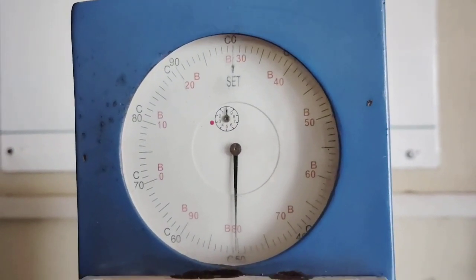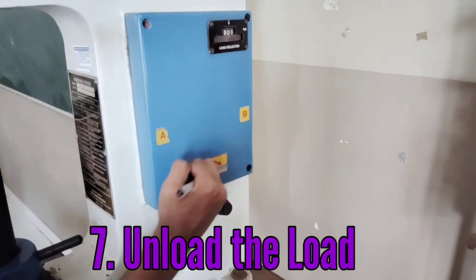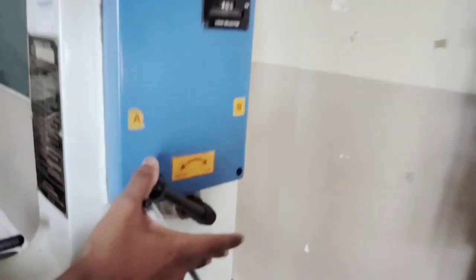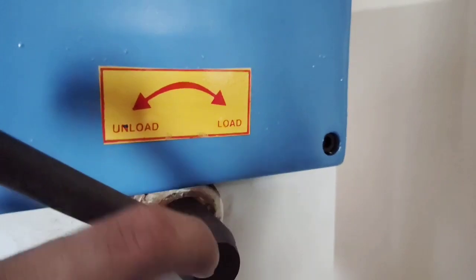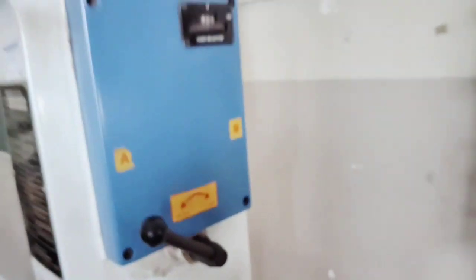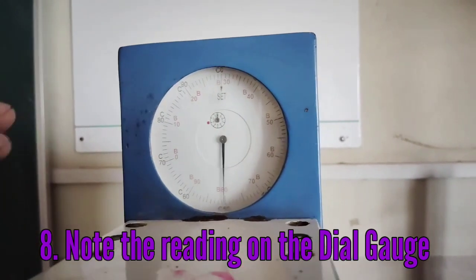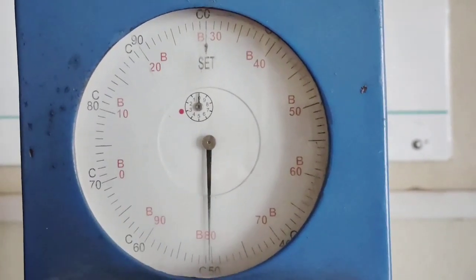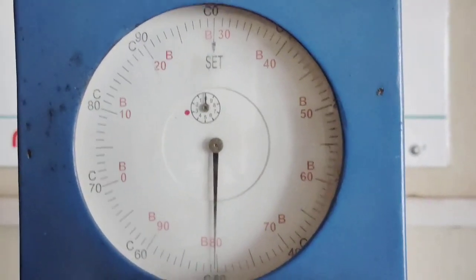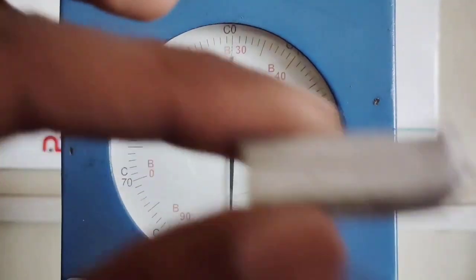After the load is applied, we will unload this. As you can see, first it was loaded, now it is unloaded. After this, we will see the dial gauge again and it will show a reading. That reading on the red dial gauge is the hardness of the aluminium specimen that I am using, this one.